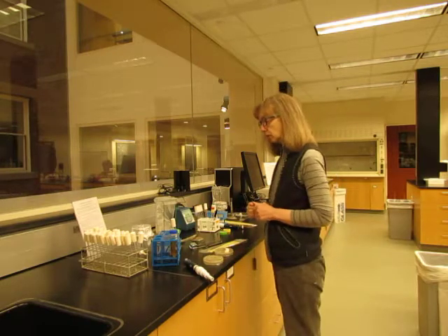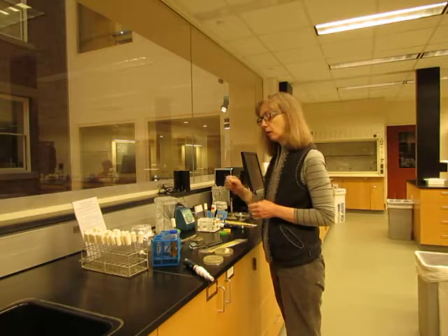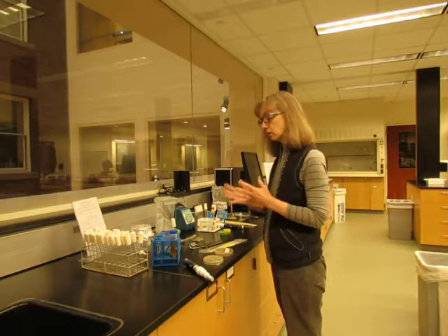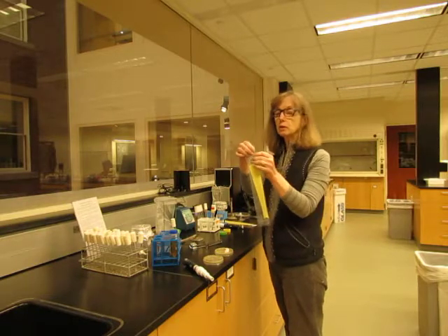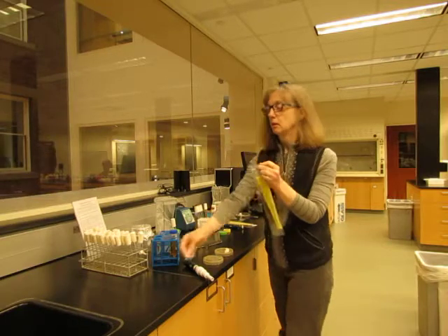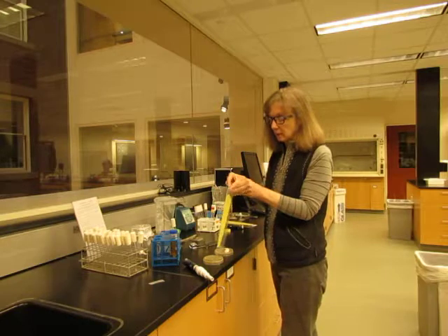Now we have our media in our tube. The next job is to, in a sterile manner, grab a colony off an agar plate and get it into the tube so that we can start our culture. We have sterile disposable loops: when first opening a bag there's a perforated tab that comes off and then there's basically a zip-lock bag.